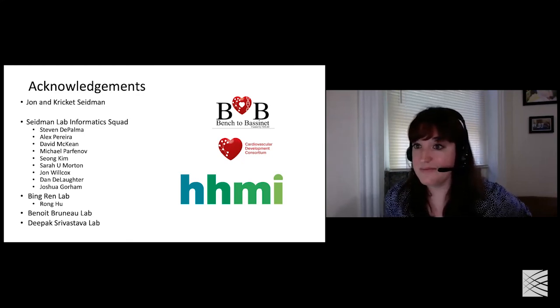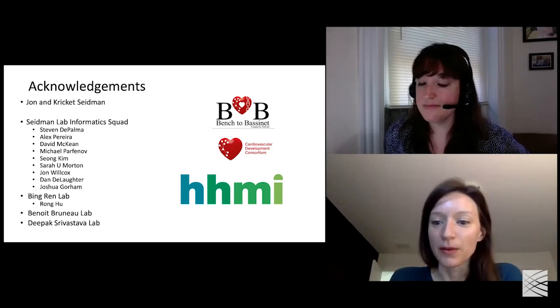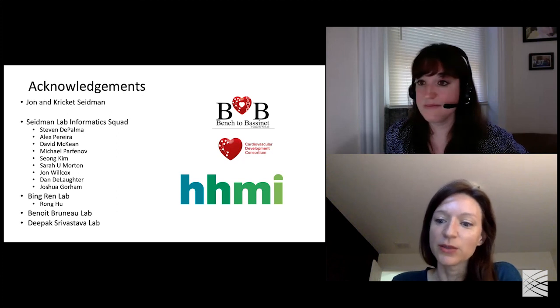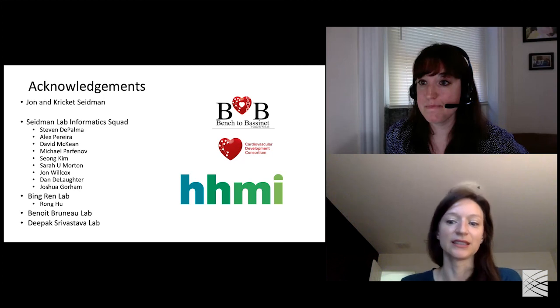Thank you so much, Lauren. I think we probably have time for one question, which just came through. And the question was how to get differentially expressed accessible regions with ATAC-seq.